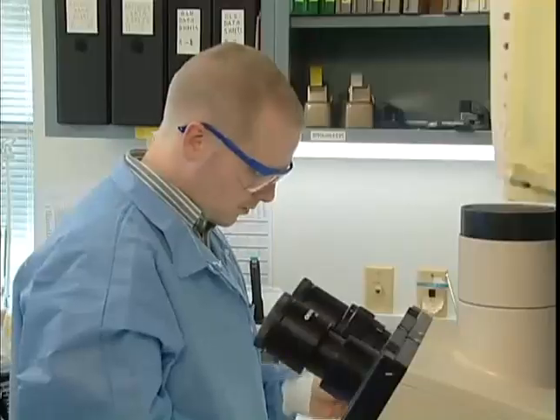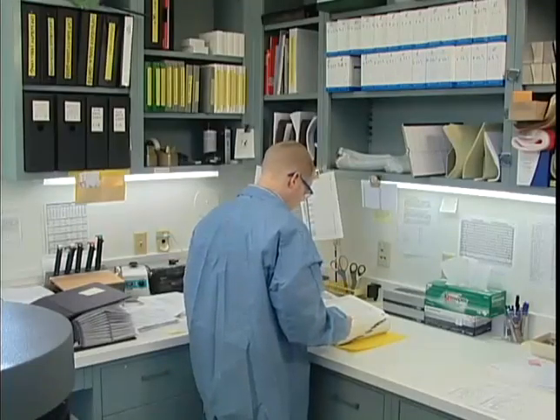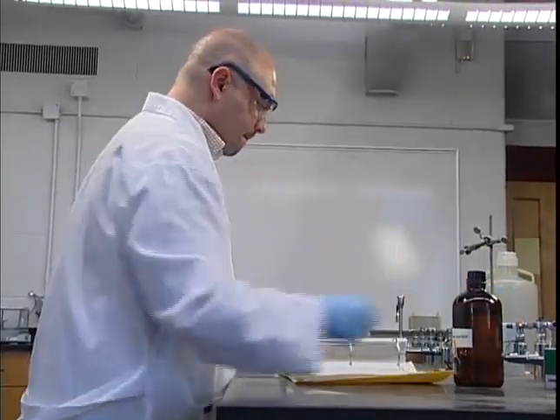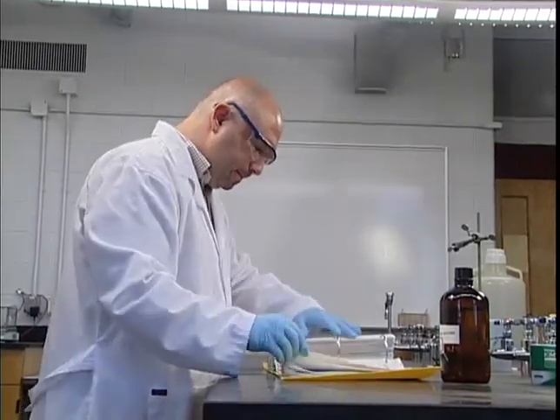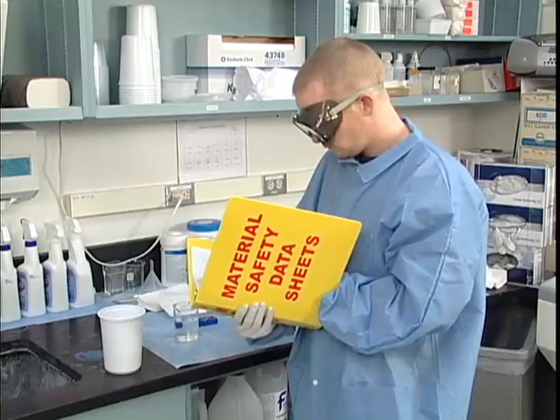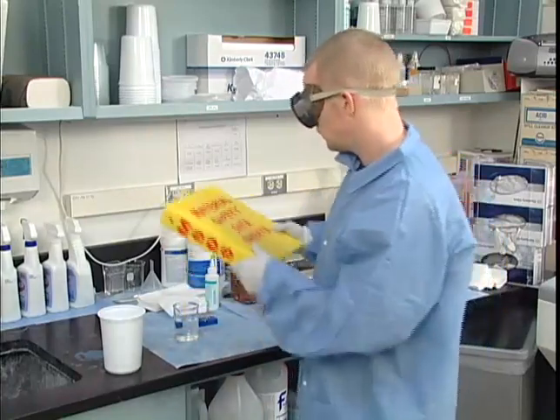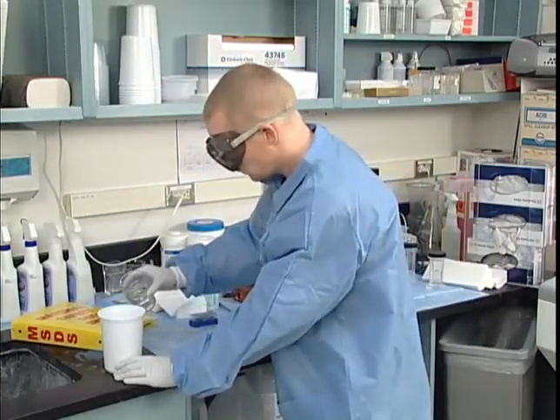This often made it hard to find the information that you needed, and in an emergency situation, this could cost valuable time. Another difficulty with many material safety data sheets was that they were written in technical language, as if they were intended only for health and safety professionals. However, many other types of people, such as firefighters, emergency medical technicians, and laboratory workers like you, also need to be able to understand what MSDSs tell them.